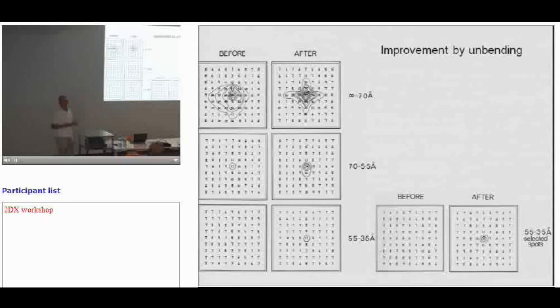And absolutely the opposite holds with single particle EM, because you have no spot and background. And when you put it together, you're refining it together into a self-consistent structure. And it might be right and it might not be right. And so one of the challenges in single particle is to develop the same kinds of signal to noise criteria where you have some of the information from your images left out of the processing, and you can look at it and be absolutely assured that you've done it right. And so almost before you start merging and calculating the structures, you know you're onto a good thing and you know you're doing it right.